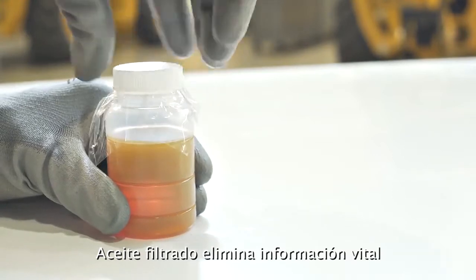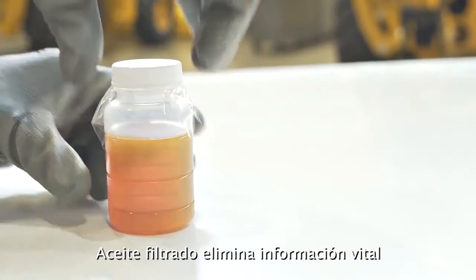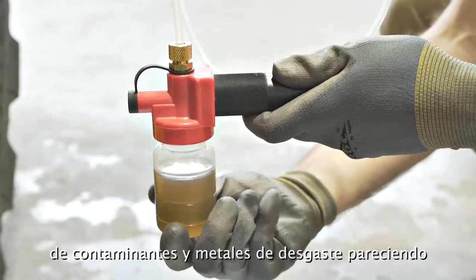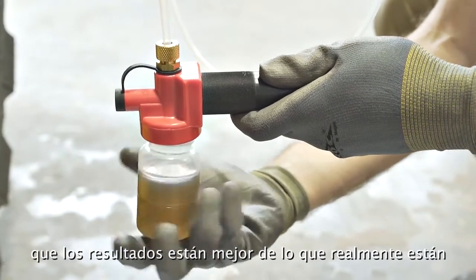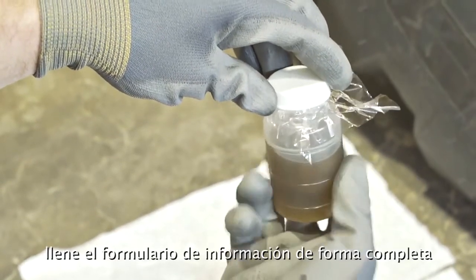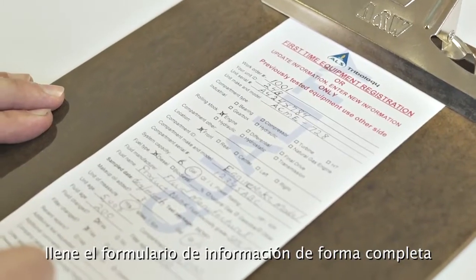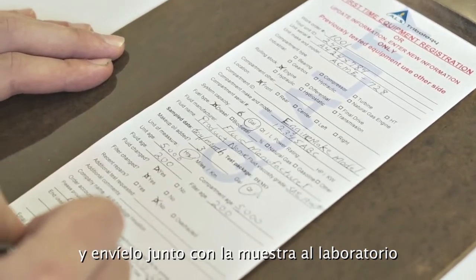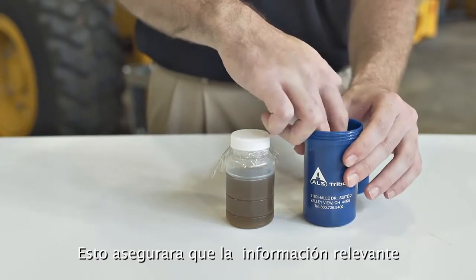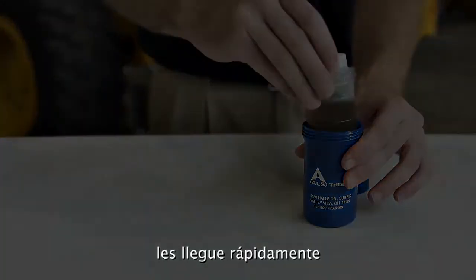Freshly filtered oil removes valuable information. Adding new oil dilutes the levels of contaminants and wear metals found, which may result in conditions appearing better than they actually are. Do not reuse sample probes. Fill out the sample information form completely and submit the form and sample to the designated regional lab for testing as soon as possible. This will ensure timely and relevant information.